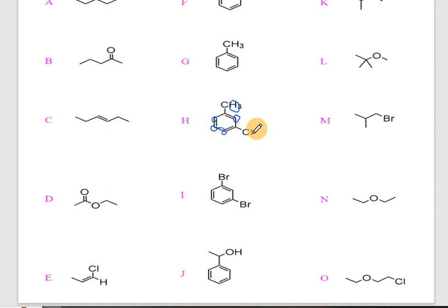Here, the chlorine and the methyl, they're not the same. That means that these carbons here will all have different electron densities. So we say they are all in different chemical environment. Actually, they are the same, so it almost confused me. So here we have 1, we have 2, 3, and 4, as well as the one on this carbon. So 5 signals for proton NMR. Then for carbon 13, we can have 1 here, can have 2 here, can have 3, can have 4, can have 5, 6, and 7. So this compound displays about 7 signals for carbon 13.